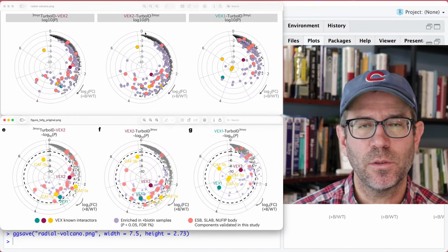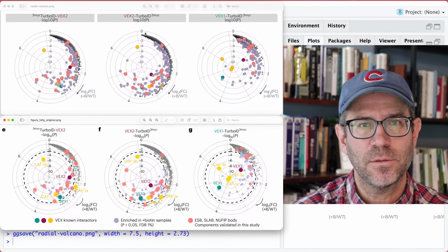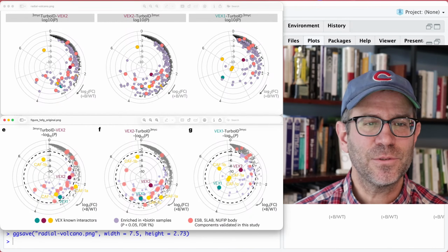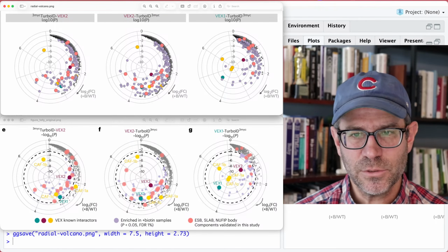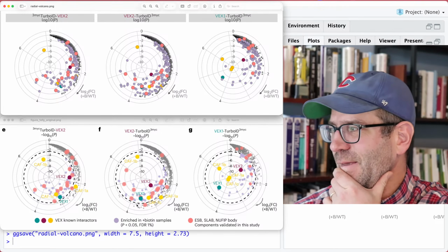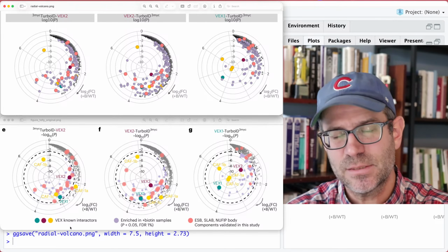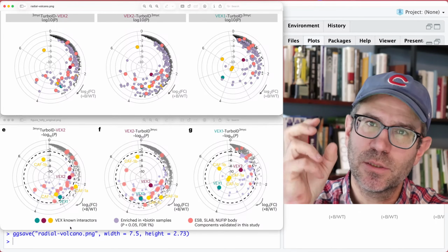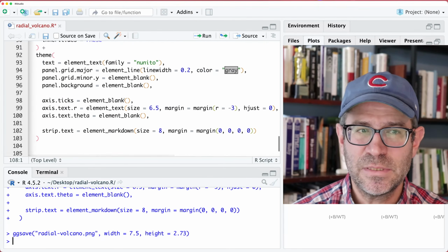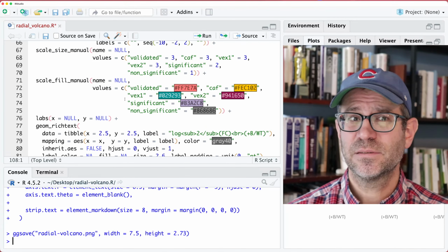All right. So one challenge, well, what I'd like to do is give more room to the 3 radial diagrams. Well, hold on. Let's do the legend. All right, sorry. So let's do the legend. We're getting pretty close. So again, this is similar to what we did last week with the section headings in the legend, and that we're going to use different scales to get the effect we want.